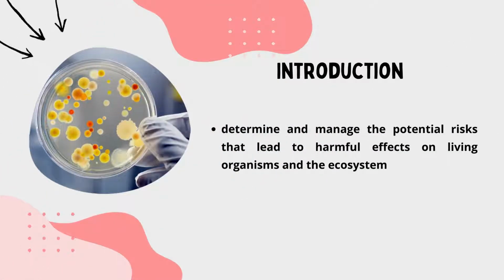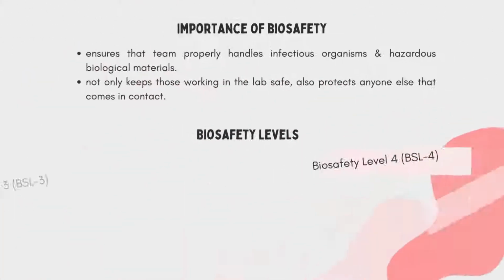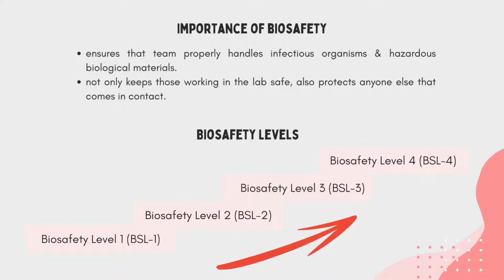Biosafety is the prevention steps to determine and manage the potential risks that harm living organisms and the ecosystem. The importance is to ensure proper handling of infectious organisms and hazardous biological materials. It keeps personnel safe in the lab and also protects outsiders who come in contact.